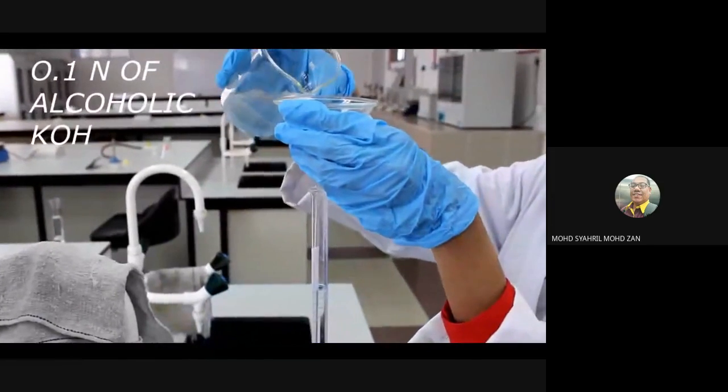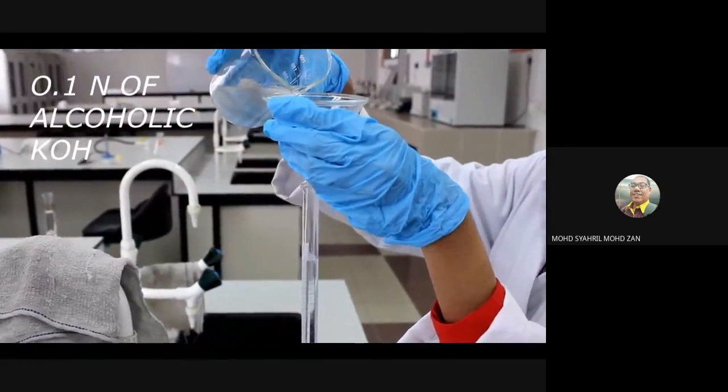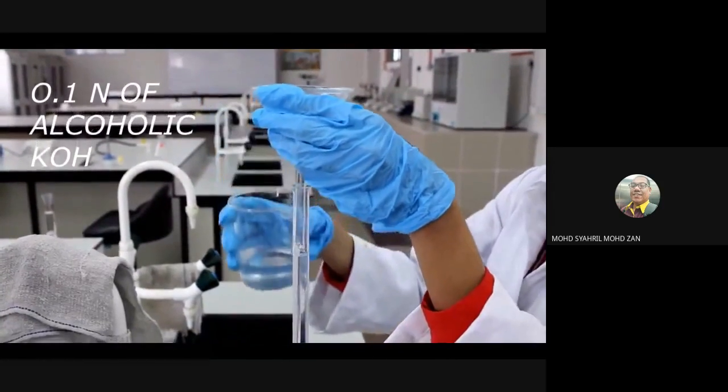At the same time, fill the burette with 0.1 normality of alcoholic potassium hydroxide until the calibration mark.